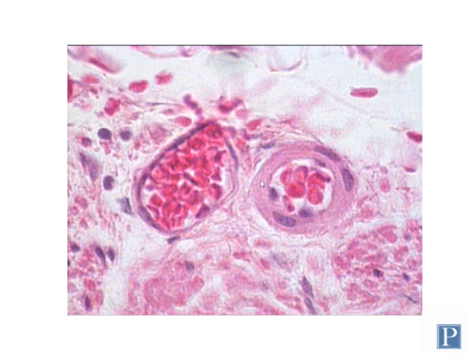In this section we have a couple slightly larger blood vessels. Here on the right you have an arteriole, and on the left you have a venule. And you can notice the difference between these two structures. The arteriole has a more regular, circular shape to its wall. The venule has a wider lumen, a thinner wall, and because the wall is thinner, it tends to lose its shape and becomes an irregular shape when it's sectioned.